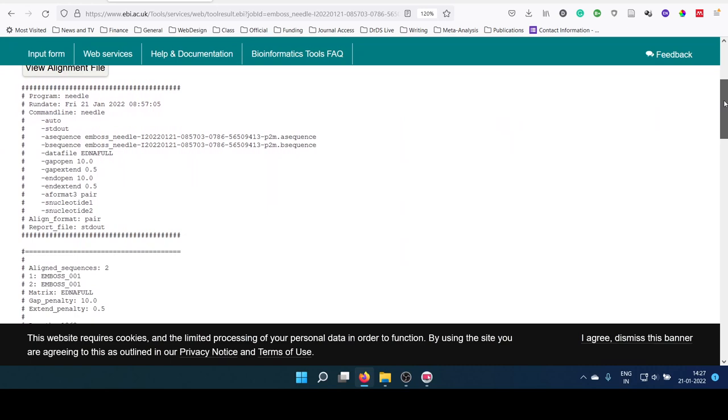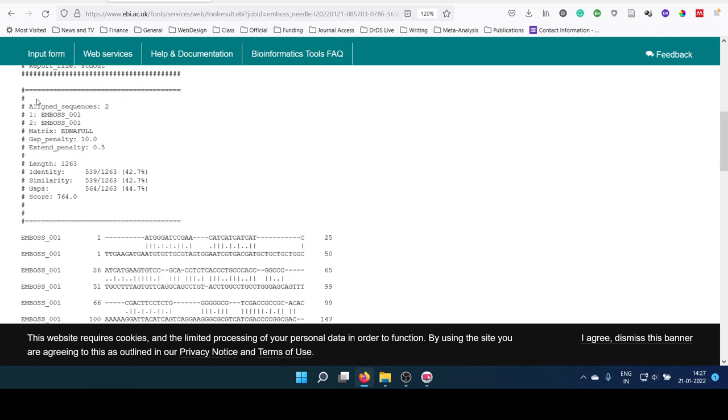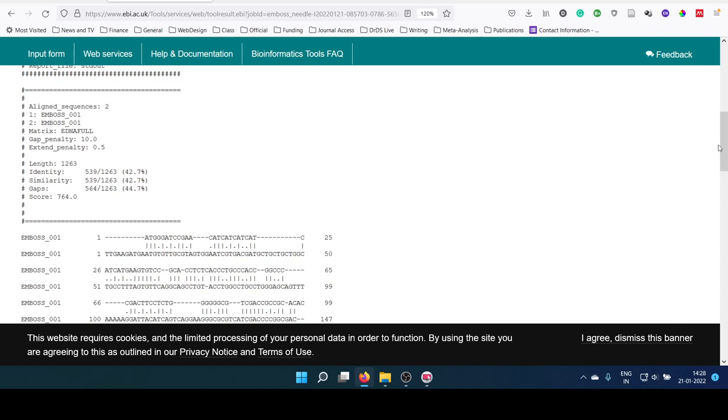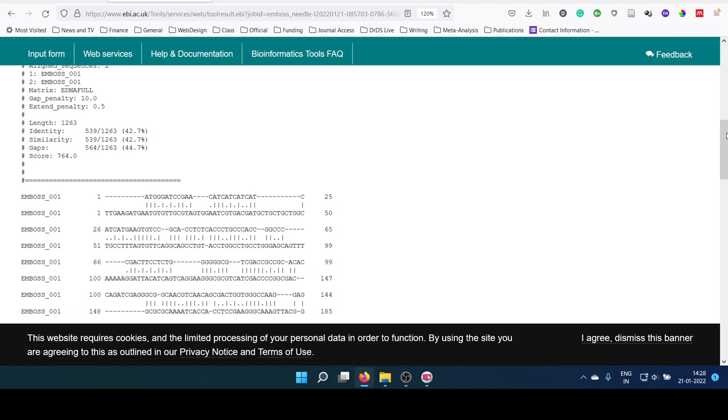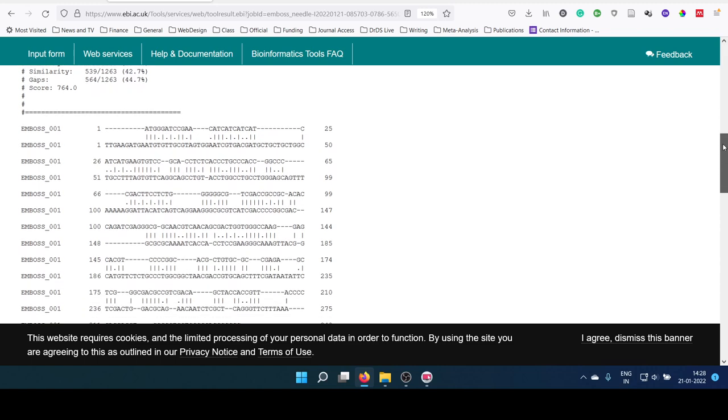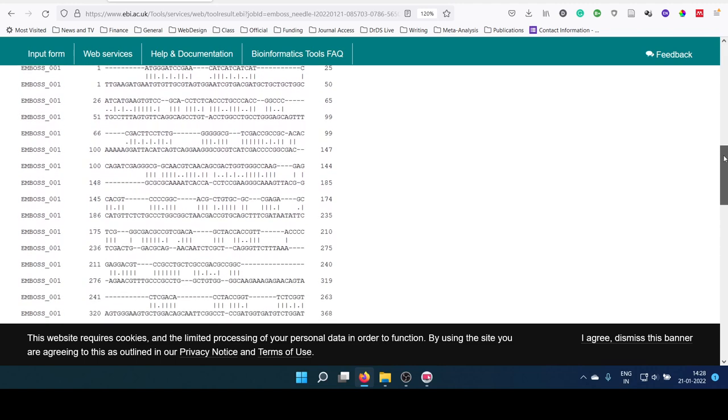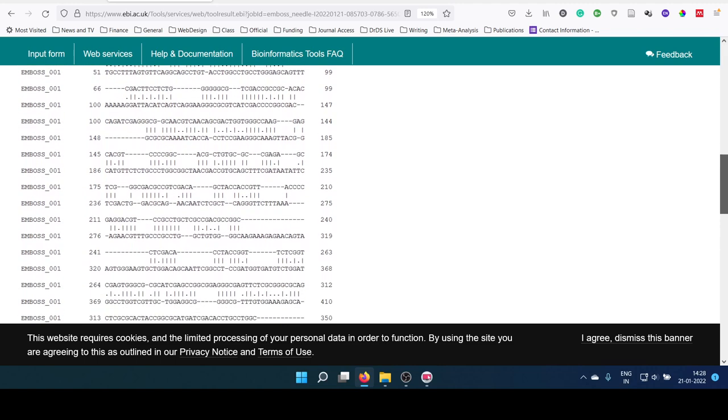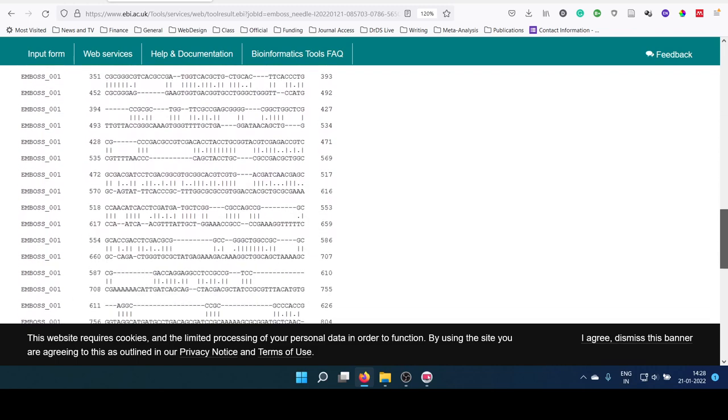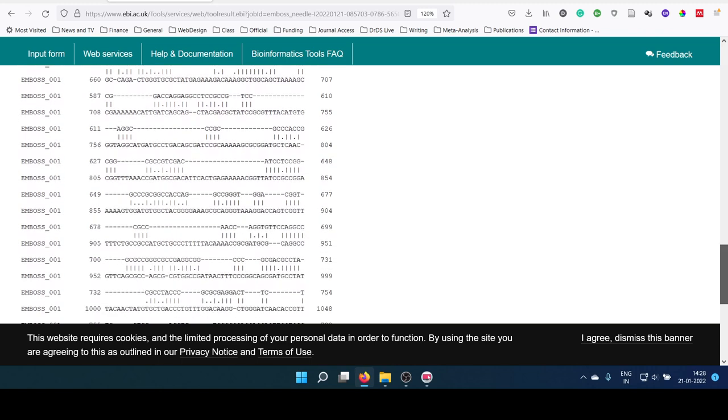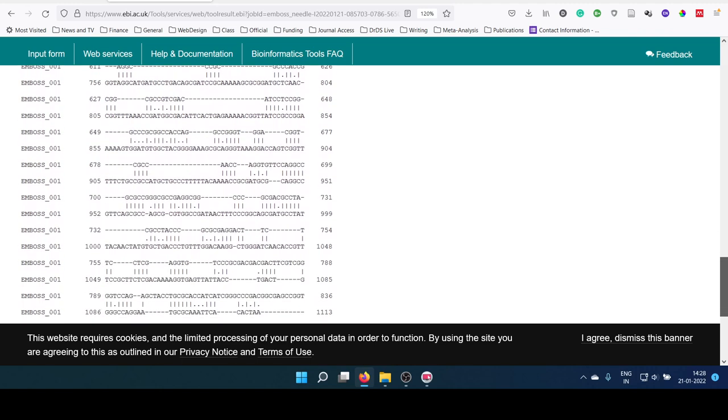You can see that the program used is Needle, time and date is given, and various other arguments which is passed into the software is actually given here. Now, it is aligned with the two sequences. Gap penalty is 10, gap extension penalty is 0.5. Identity is this much, that is 42 percentage, and similarity is this much. Because these are two entirely different sequences, there is not much similarity. Only the similarity is about less than 50 percentage.